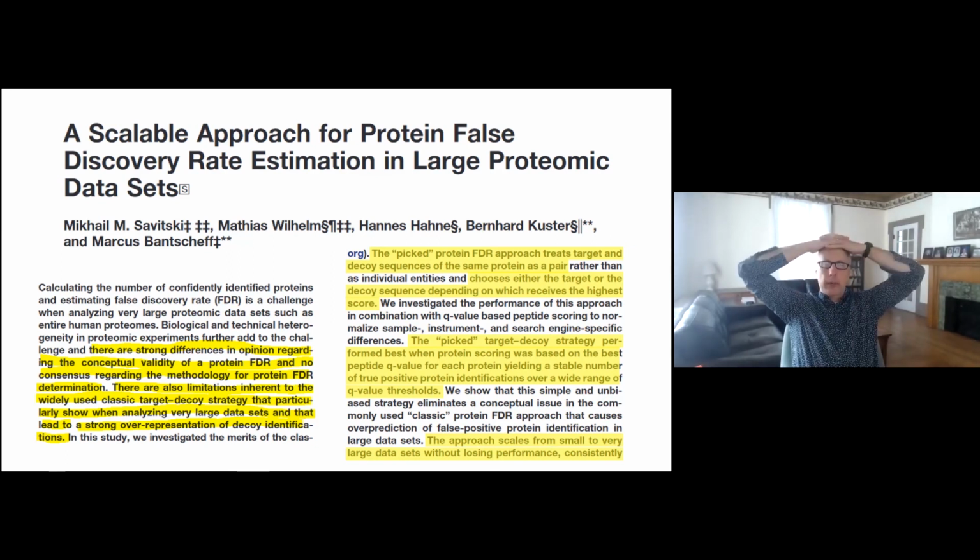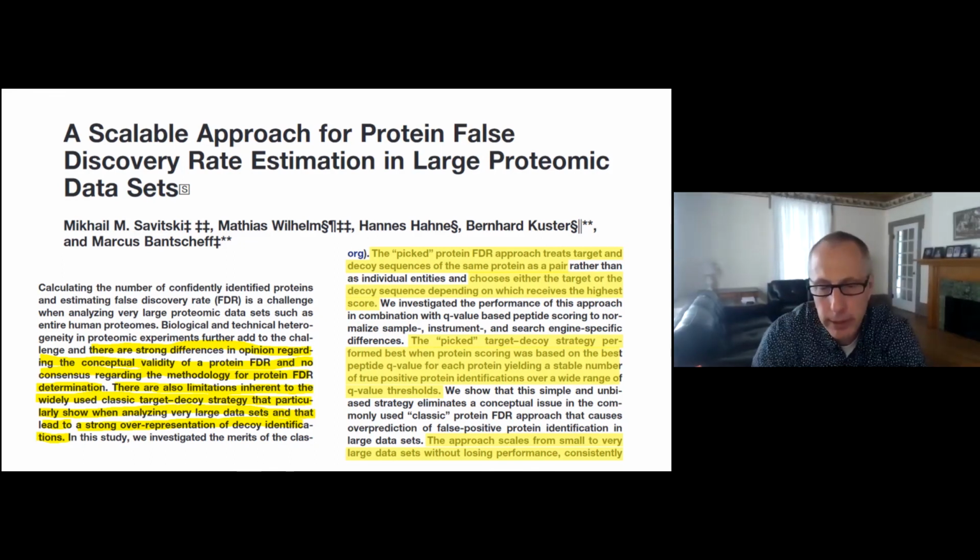Okay, so this is a sort of a strange little beast, but basically if the decoy happened to have a higher scoring top peptide than the true one, we would throw the true one out. Okay, and so these things are all sorted from top to bottom. And again, we're using a 1% cutoff. But people tend to like that, but this is really, I mean, this is soft earth as far as I'm concerned. You know, it's what we do. I think it's maybe the best thing we do, but it's a real heuristic, you know.